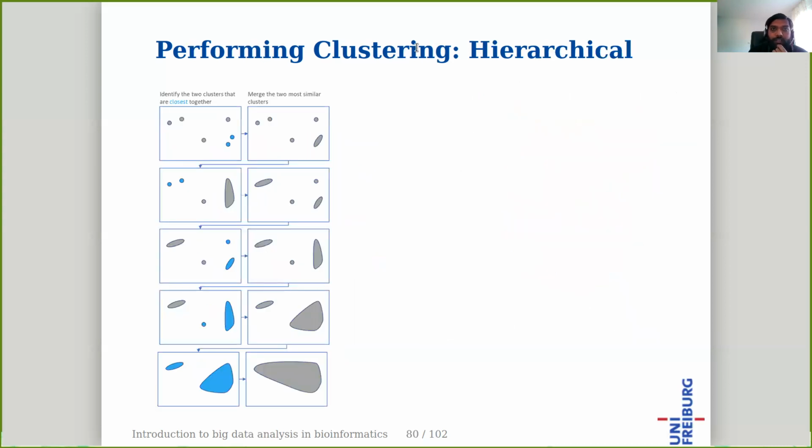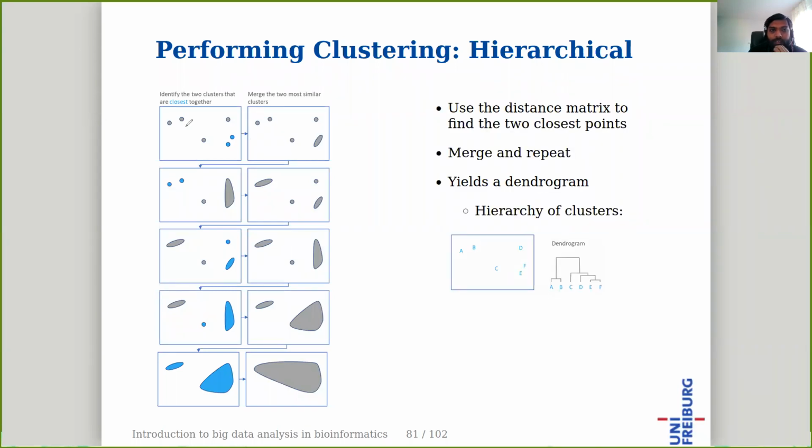And then there's hierarchical clustering, for which you need a distance metric. So you take the distance matrix, and from it you take the 2 nearest ones and merge them together. Then again you take the next nearest ones after merging, and merge them together, and take again the 2 which are near, and merge them, and so on, until you end up with only one single cluster.